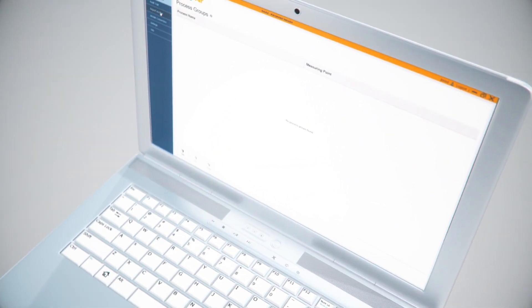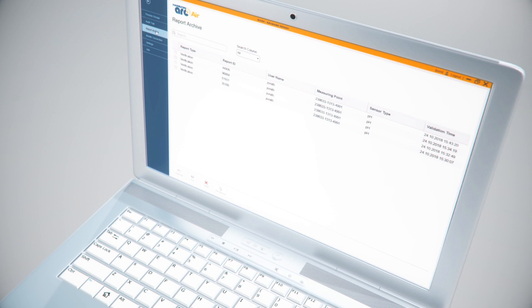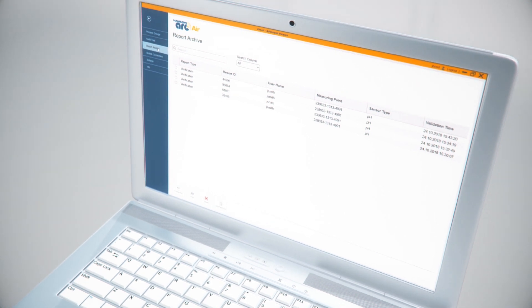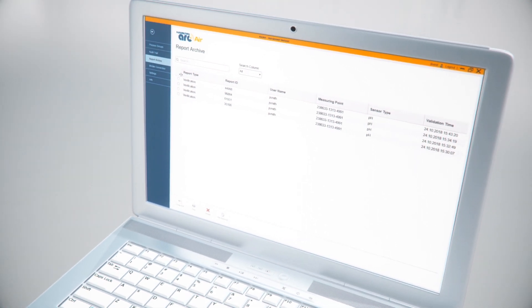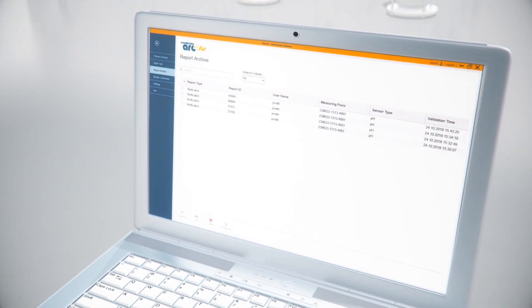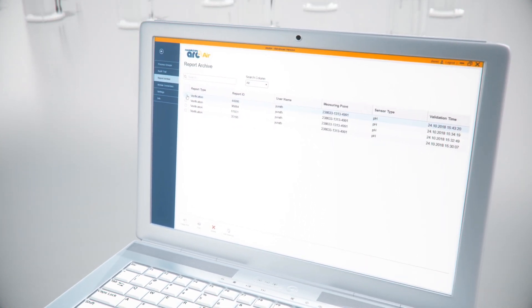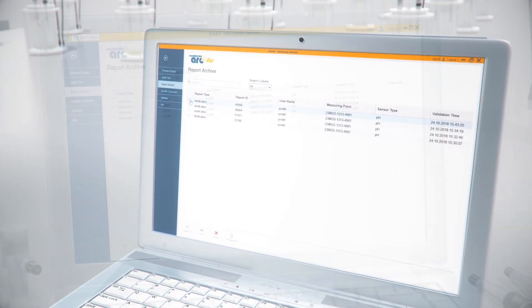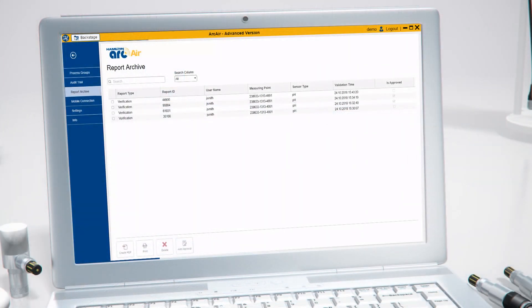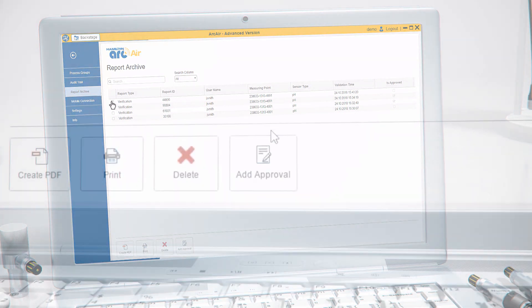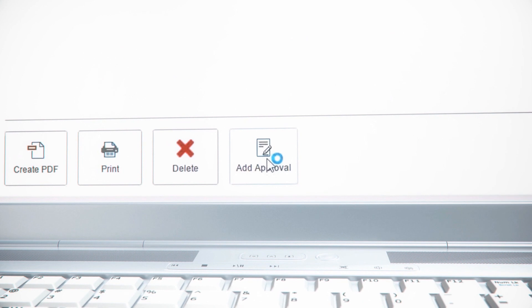Following the four eyes rule, a second user can approve the calibration report so that the report contains the electronic signatures of two different users. To do so, the second user needs to log in with his or her credentials, access the report archive, select the desired report, and click on Add Approval.